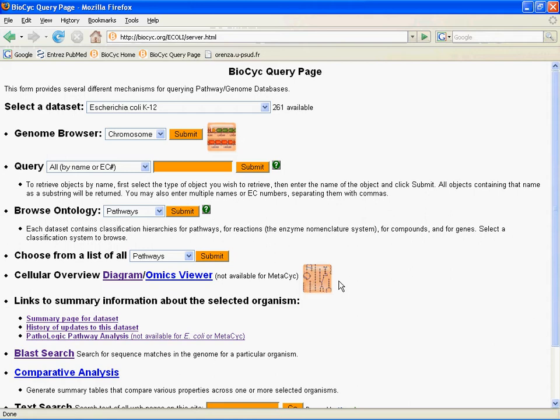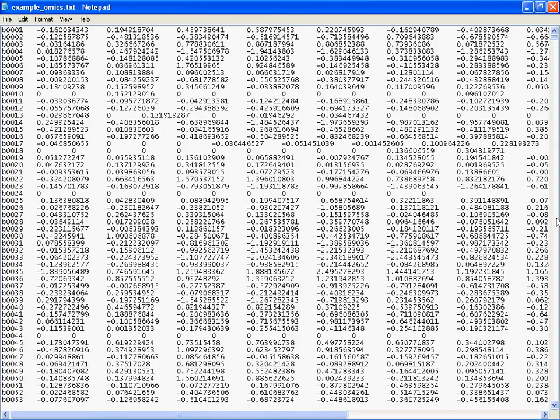For today's webinar, I've taken some gene expression data sets from the University of Oklahoma's E. coli Gene Expression Database. These are stored as tab-delimited text files, which is perfect for the omics viewer. I'm going to show you what the data file we're going to be working with looks like. This is a gene expression study — the response of E. coli to peroxide exposure. The first column contains the B numbers for E. coli genes, and the subsequent columns are data values for those genes for each time point. This is not really intuitive and is kind of gibberish if you just have to stare at it. Today we're going to show you how to put this into a metabolic context using the cellular omics viewer.